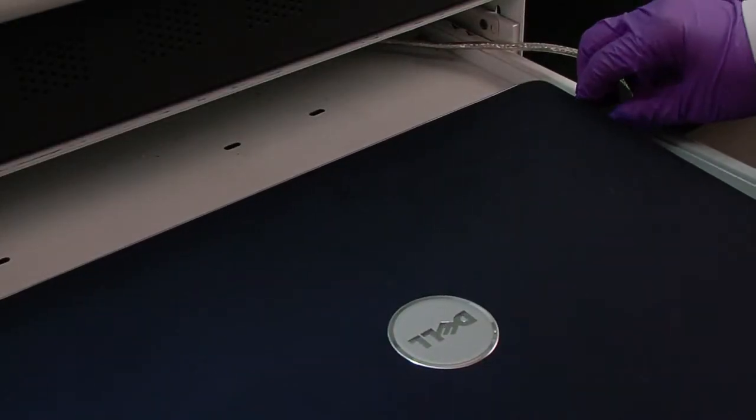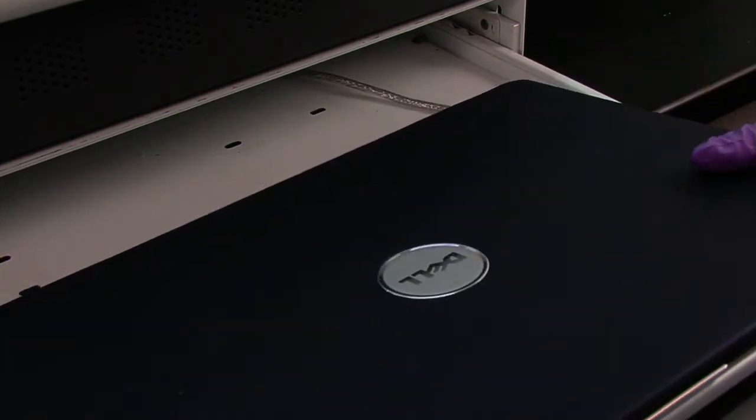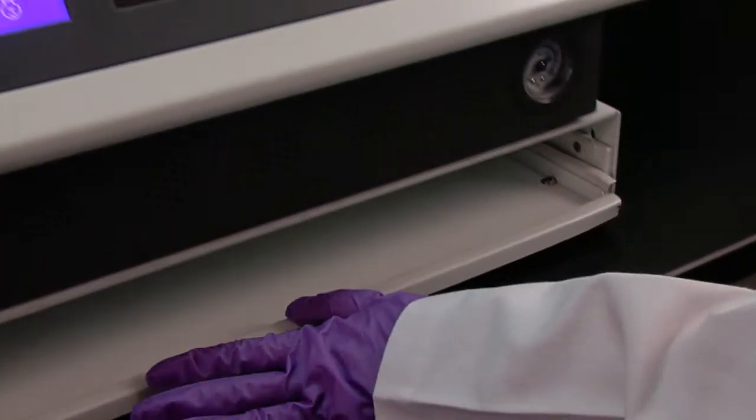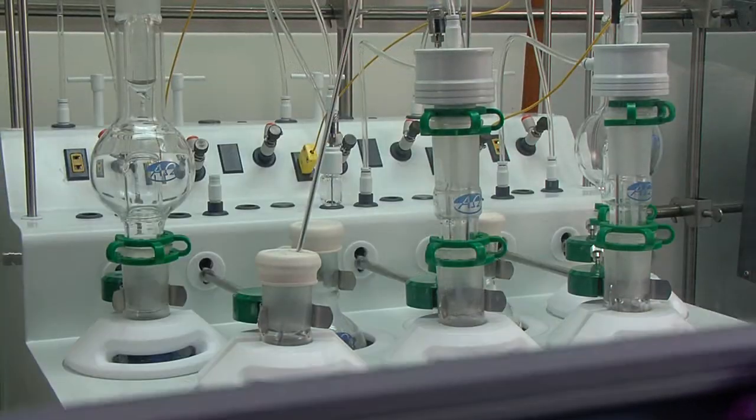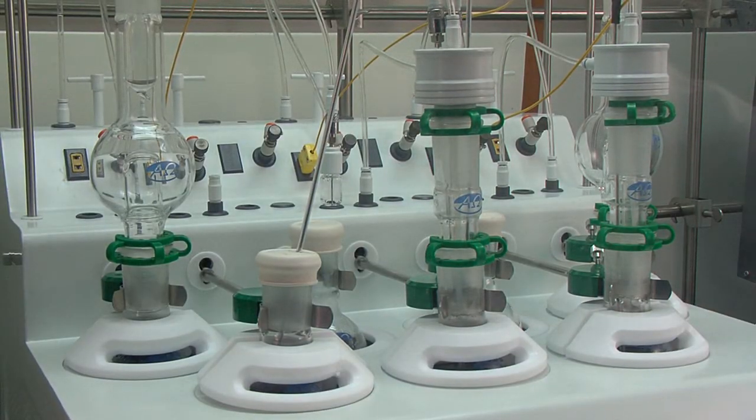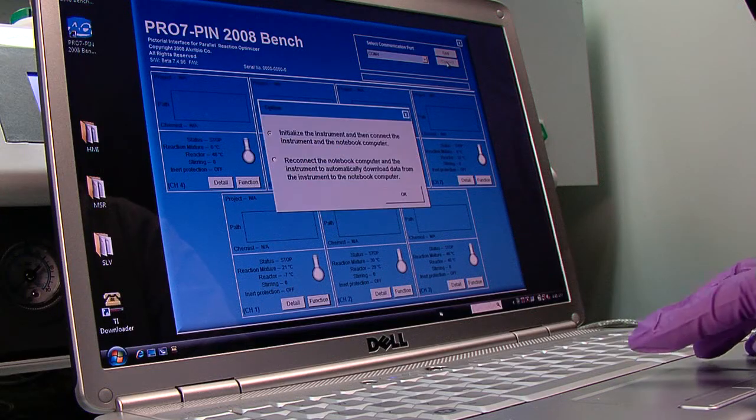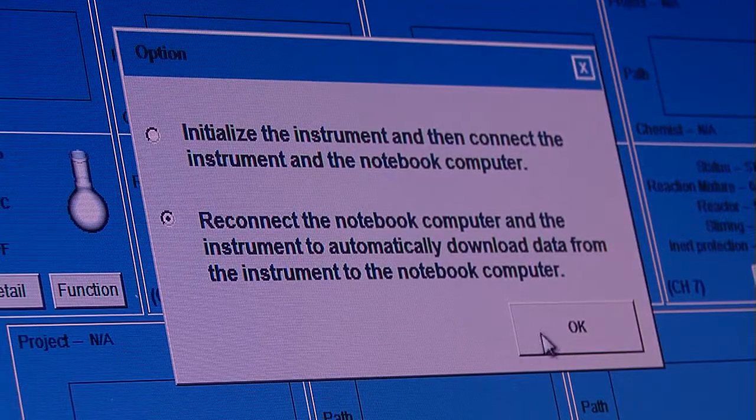After setting parameters, if desired, you can unplug the computer and take it away. Pro7 then runs by itself because it has built-in CPUs and memory chips. Once the computer is reconnected, all the data can be retrieved from Pro7.